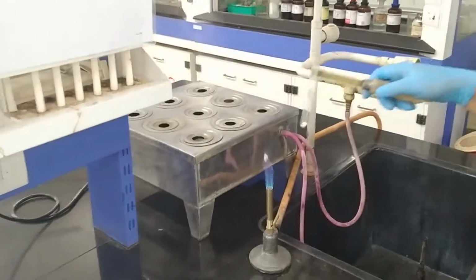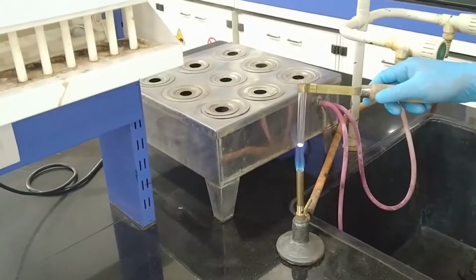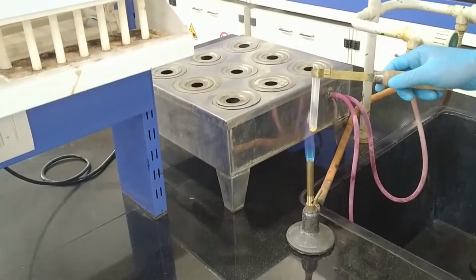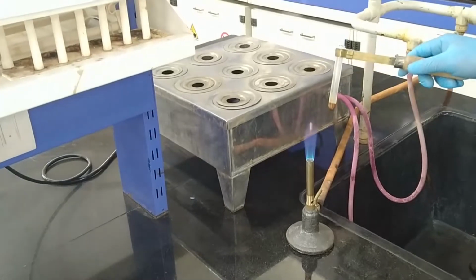Okay, so I just put it in the flame. The positive observation of this one is charring or not.